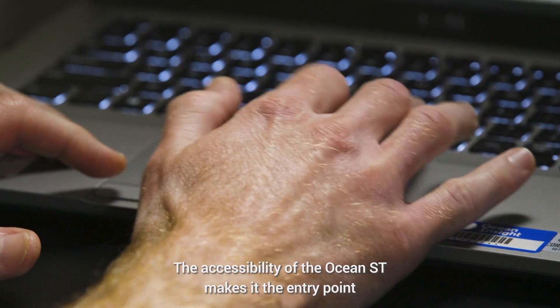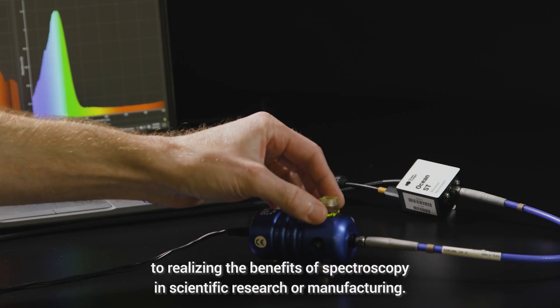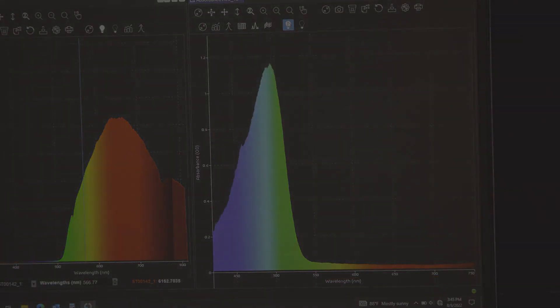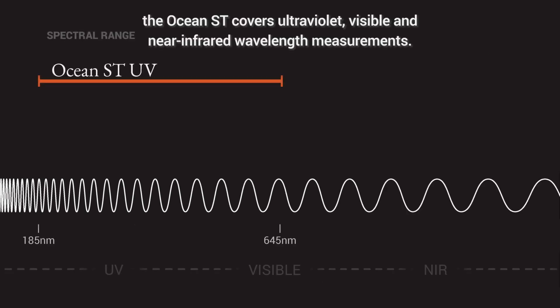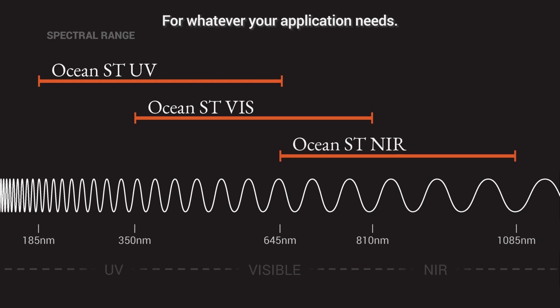The accessibility of the OceanST makes it the entry point to realizing the benefits of spectroscopy in scientific research or manufacturing. Available in three configurations, the ST covers ultraviolet, visible, and near-infrared wavelength measurements for whatever your application needs.